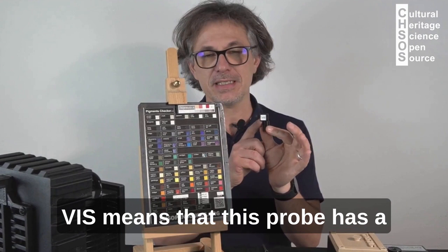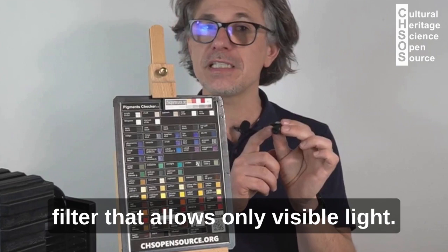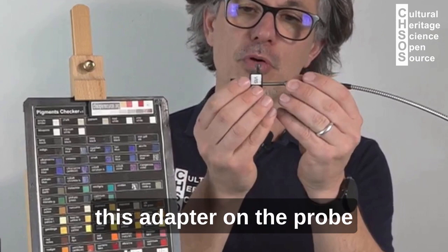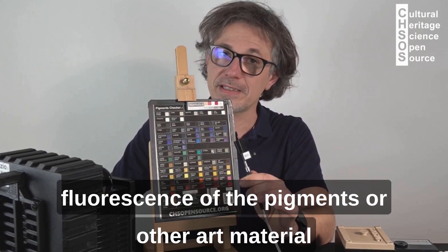We now explore the Vis probe. Vis means that this probe has a filter that allows only visible light, so about 400 to 700 nanometers. We mount this probe on the adapter. With this adapter we can measure the visible fluorescence of the pigments or other art materials.